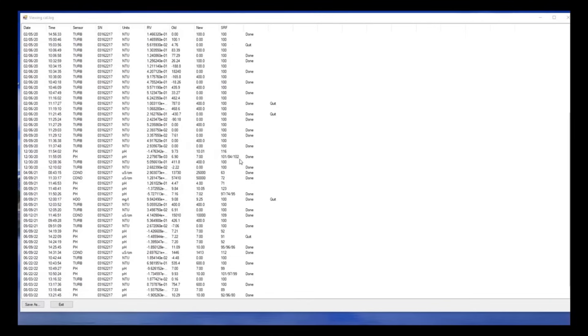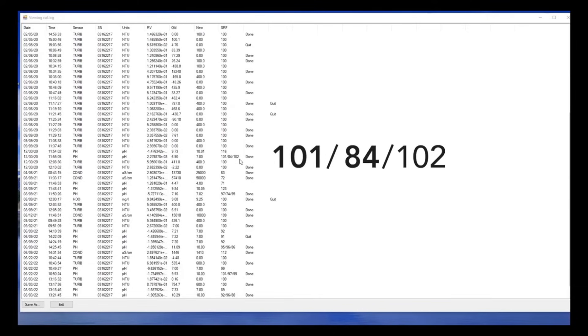The pH SRF has three numbers. The first indicates the success of your first buffer. The second indicates the success of your second buffer. The third indicates your overall success compared to the calibration of a typical pH sensor.